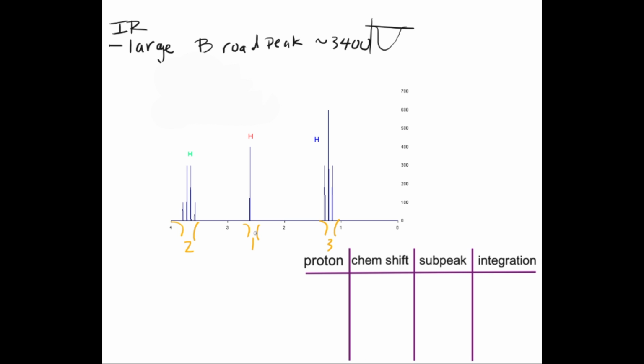Given an example where an IR spectroscopy was run, and you see a broad, strong peak at the 3400 region, you think that maybe there may be an alcohol compound. Then you decide to run an NMR spectroscopy. Based on the NMR spectra, there are 3 hydrogen environments, which means there are 3 atoms with hydrogen attachments. Note that there may be atoms that don't have hydrogen attachments, which will not show up on the spectra.